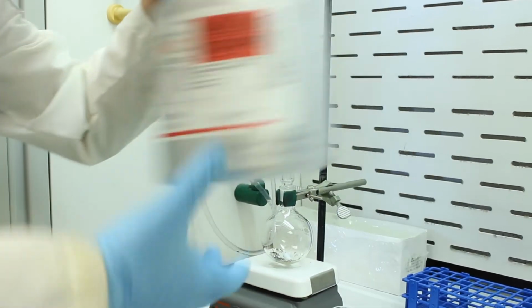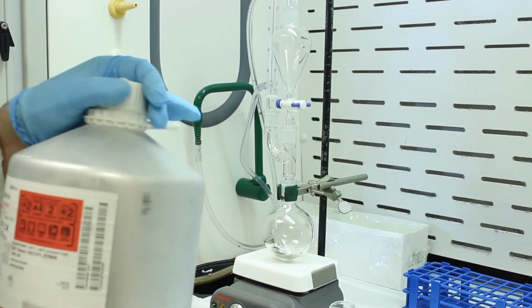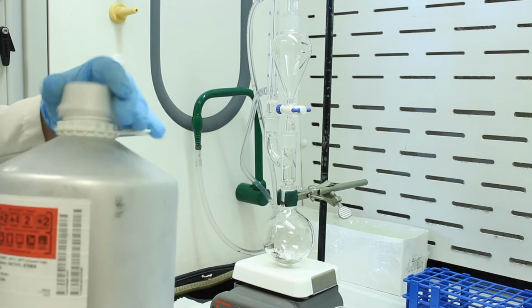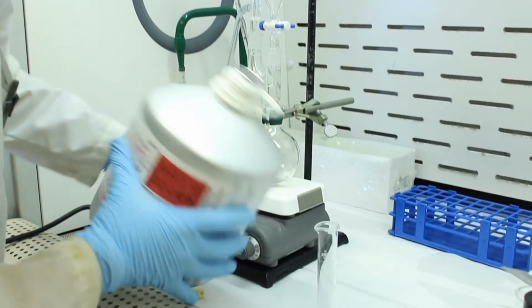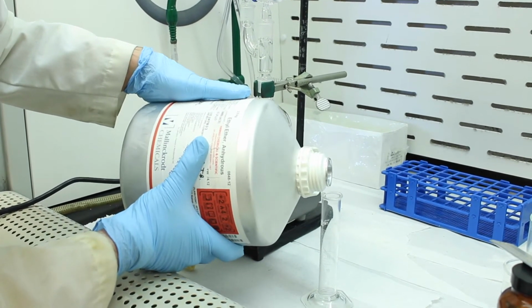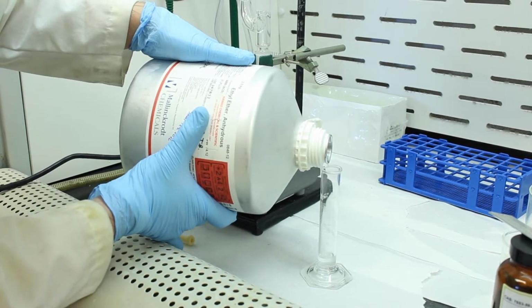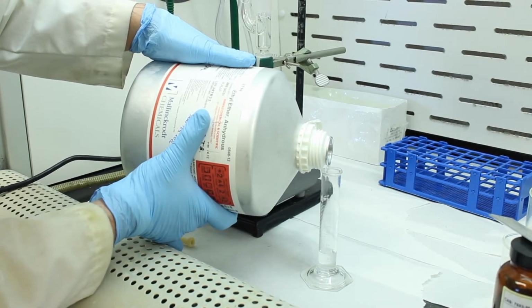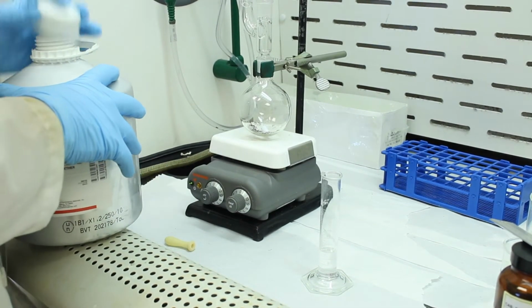So we're going to add a 10 mil portion first, and speed here matters more than precision. So we want to be fast because the ether will absorb water from the air. So we're going to try to get around 10 mils here. And ether is very flammable as well. Has a very low boiling point, which also makes it challenging to work with. It likes to vaporize. Okay, so there's about 10 mils.